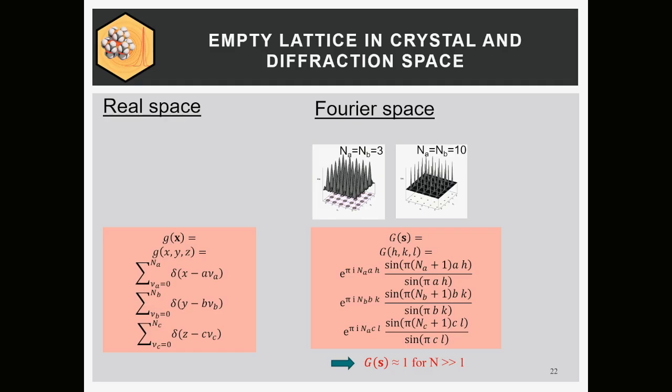So when we have our lattice function, which we derived before, again here as a 3-dimensional lattice function, if we do the Fourier transformation, we get this function here, which is well known. If you square this capital G function, it's the so-called Laue function. Okay, but it's just a word. But you see, what comes out from here is that the great thing is that all the information in reciprocal space, in diffraction space, is located on these reciprocal lattice points.